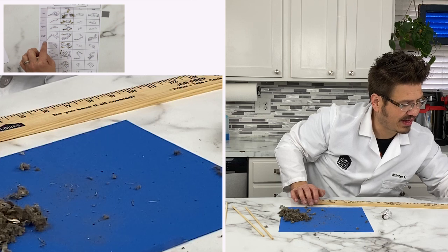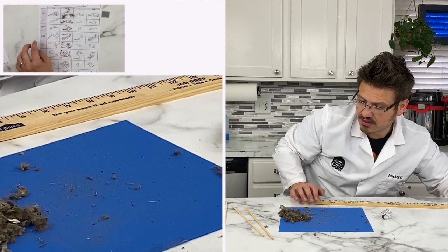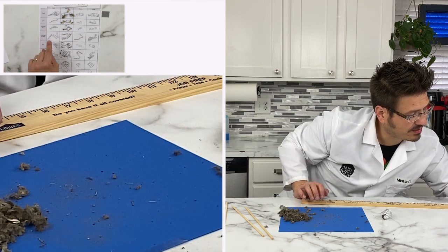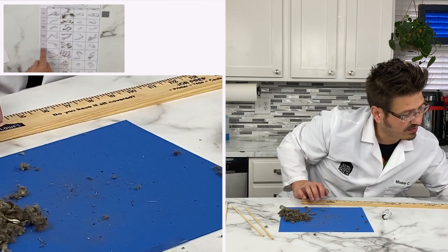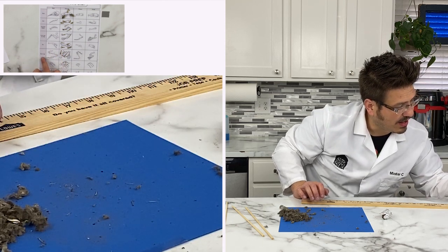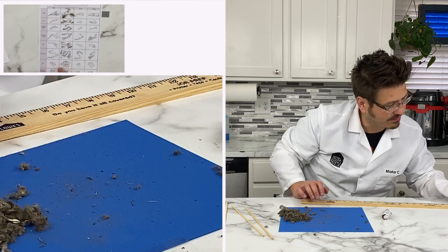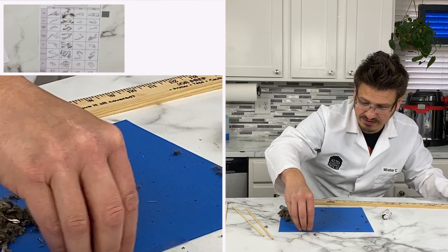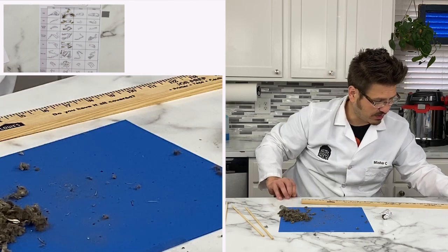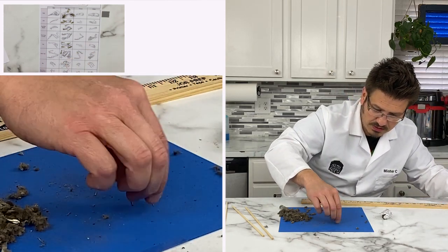And I'm sure if I had a nice little magnifying glass or something to look at these closer, I could probably identify them a little bit better. We have our hip bones, for sure. I think I can recognize those pretty well. And the back legs, some different parts there. And then our ribs. And we have tons of ribs over here still that I haven't even transferred over to the sheet. It's just loaded with them. There are tons of ribs.